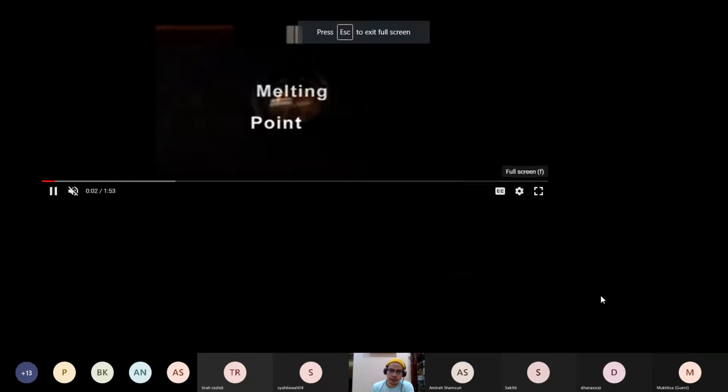Okay, so this is a video about determination of melting point. Before kita go through with the video, saya nak cerita melting point adalah sejenis test yang kita guna in the pharmaceutical industry, in QC control, in quality control. Test ini digunakan sebagai satu kaedah untuk mengenal pasti bahan yang kita test. So this is known as an identification test.